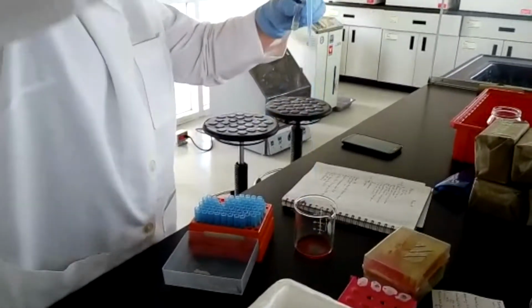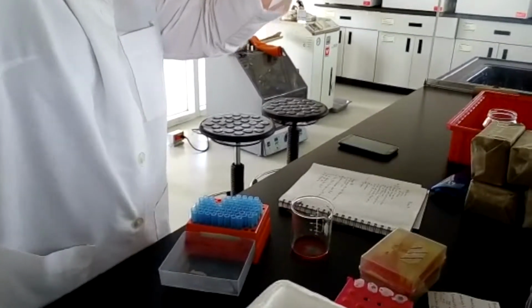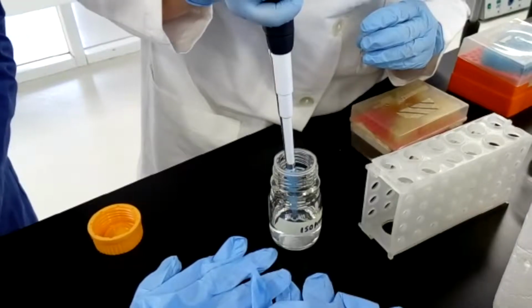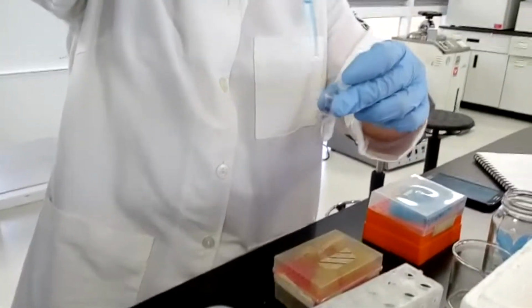To verify the presence of DNA, we can use several methods like spectrophotometry, quanti-blot, which is the quantification method by specific probe hybridization of Perkin-Elmer, optic density, and using the Lambert-Beer law.